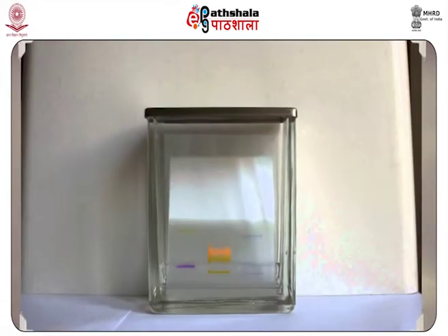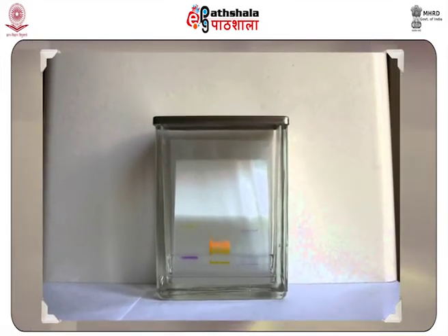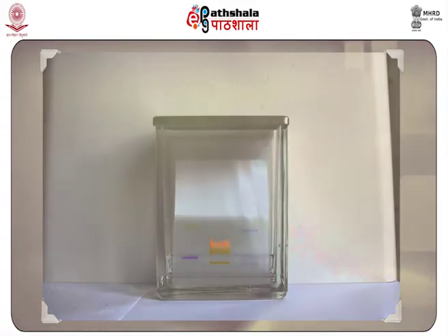The plate is placed in the chamber in such a manner that none of the spot or spots touch the eluent surface. The solvent front migrates in the upward direction through capillary action and consequently separates the sample.